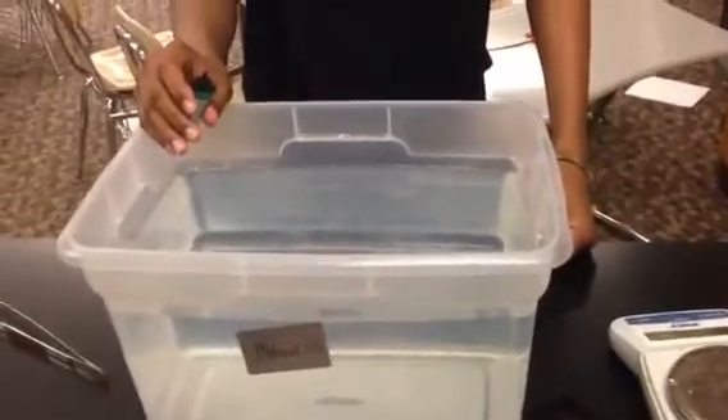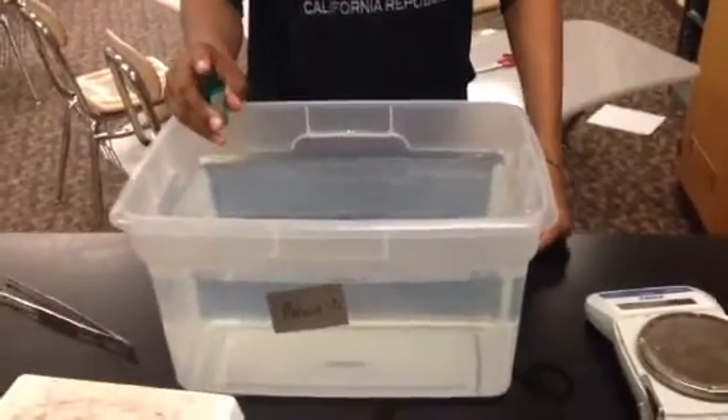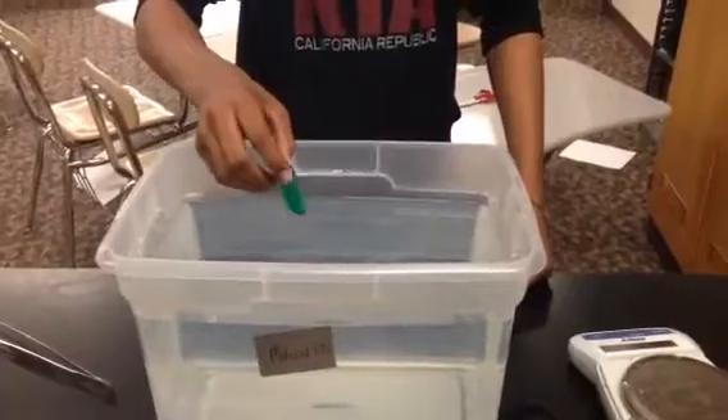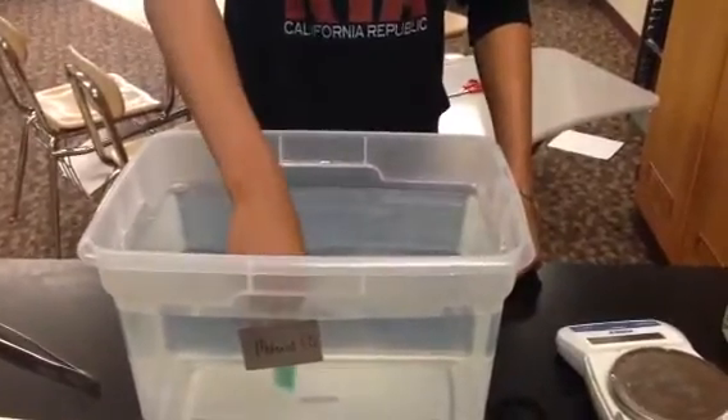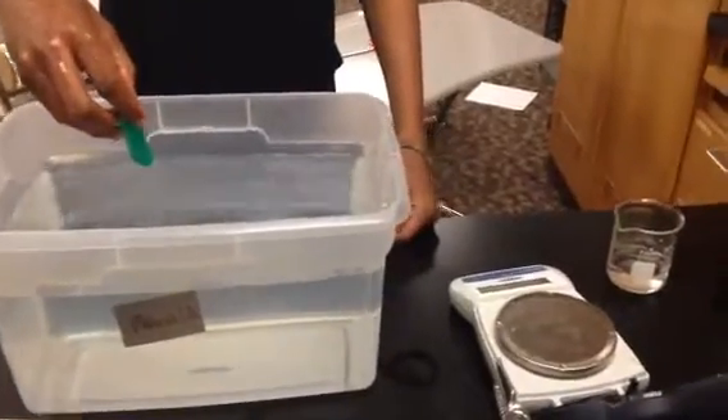I have Frank here to help demonstrate what we're going to do for today's lab. The first thing that I'd like you to do is to put the lighter into the water, all the way in. Pull it out, and you're going to take the starting mass.